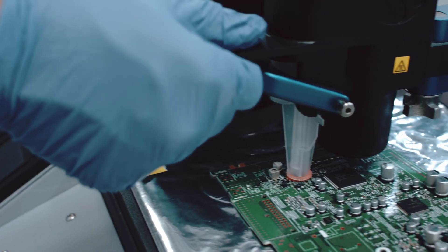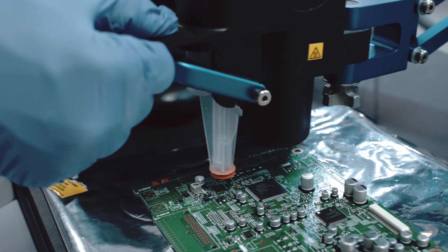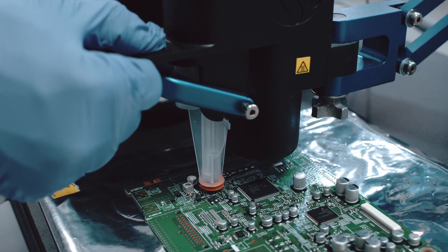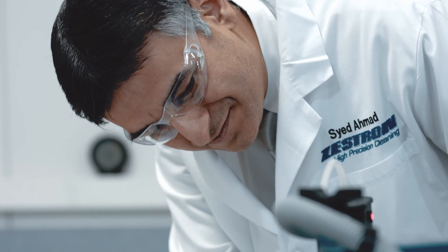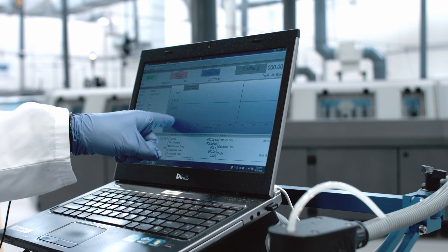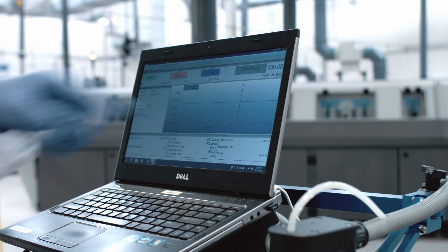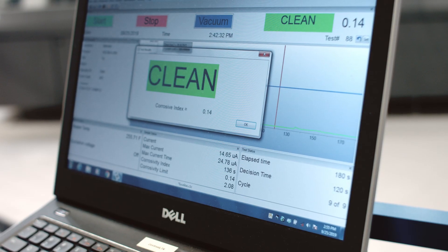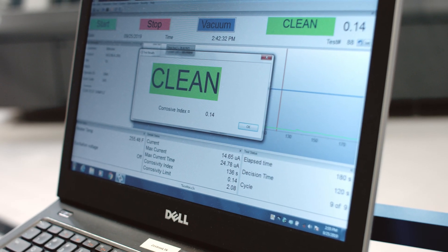Localized extraction, unlike the full board extraction, targets the critical areas of concern on the board surfaces to assess the cleanness levels. The output from the C3 records in seconds, providing an immediate clean or dirty result for the ionic contamination.